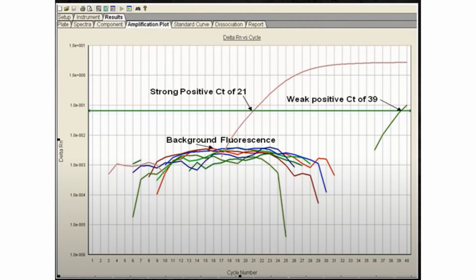There is also background fluorescence because of the autofluorescence of the samples, the vessels, and the imaging media, or fluorescence resulting from fluorophores not bound to specific targets.